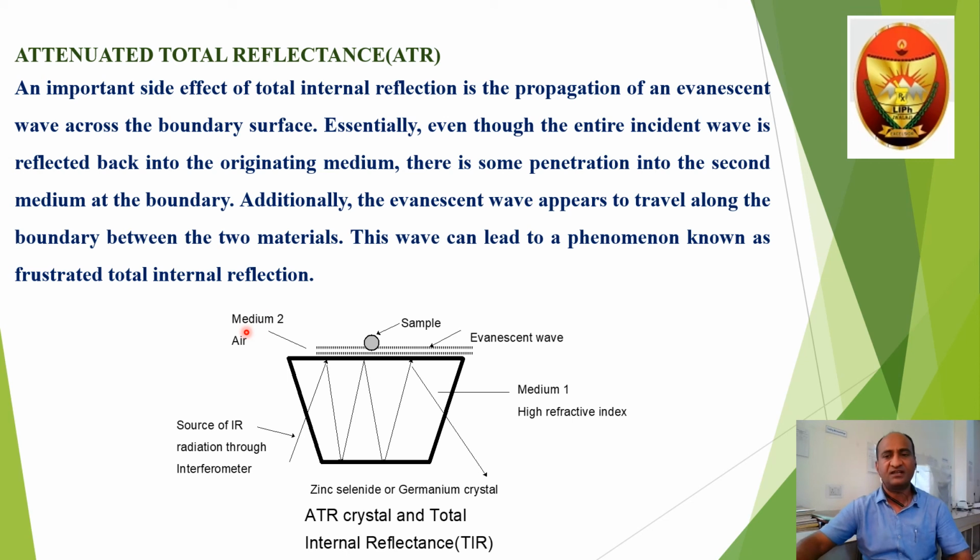Sample handling in infrared is one of the cumbersome processes, and it is time-consuming, as we have to prepare KBr pellets or mulls. So nowadays we widely use ATR crystals. With the ATR crystal or ATR plates, we can directly introduce the sample and carry out the spectral analysis. The attenuated total reflectance, ATR, principle is based on total internal reflectance.